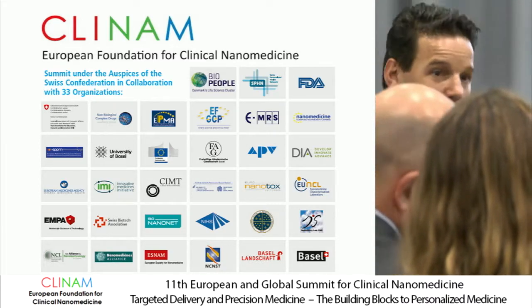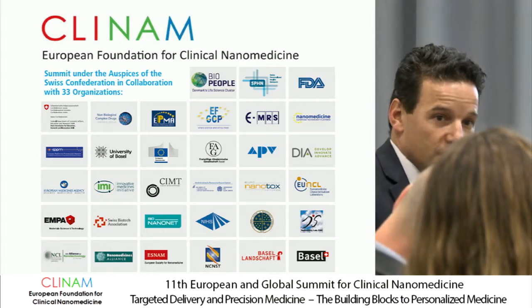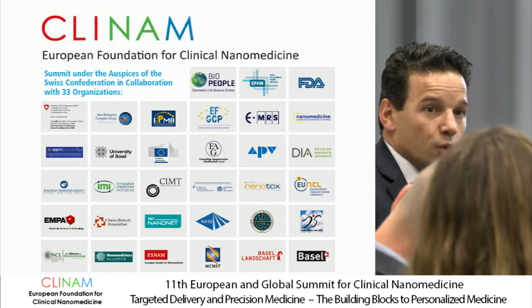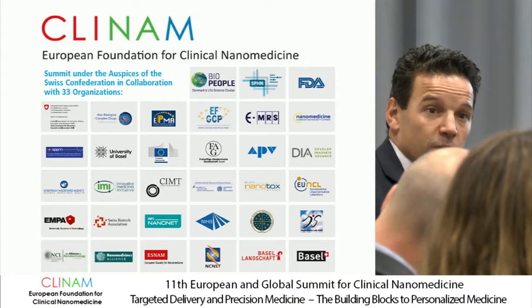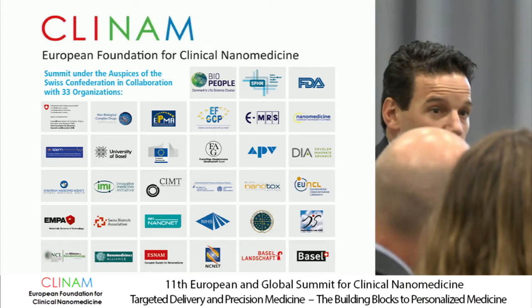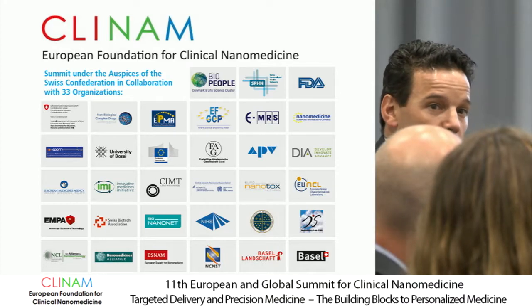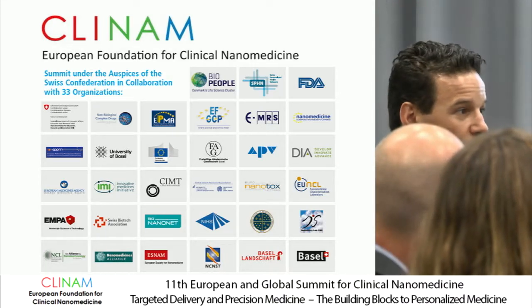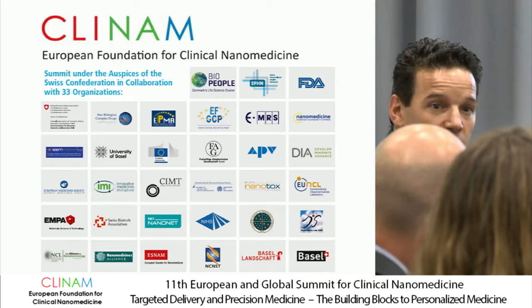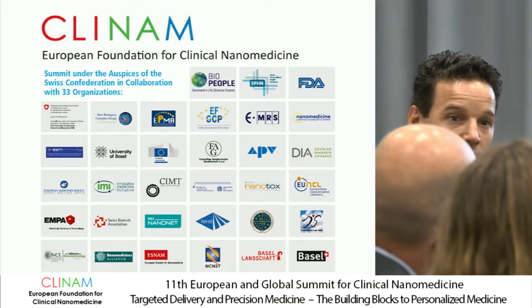And that doesn't come down to only the API efficacy, it's also the carrier that has to be proven fit for purpose. So the sizing is a function of a proper measurement, as I highlighted in my talk, and not pressing a button, but also the aspect that you're measuring what you're trying to use in this specific nanoformulation. Because if you are just feeding a matrix of information, you're not actually delivering a good service.